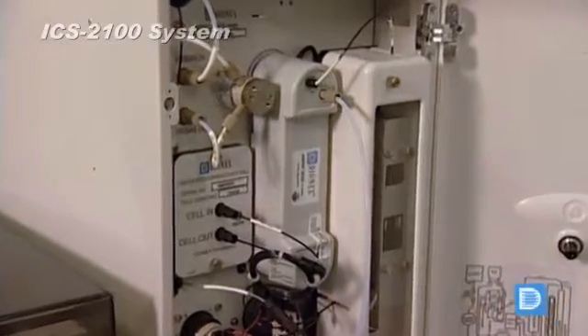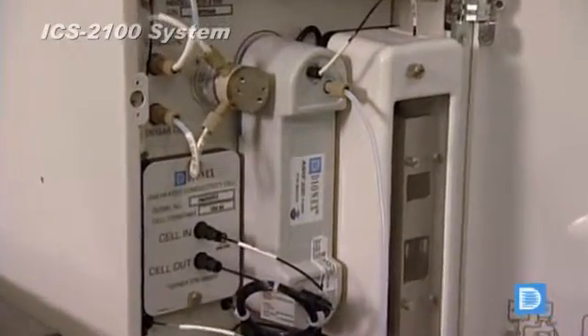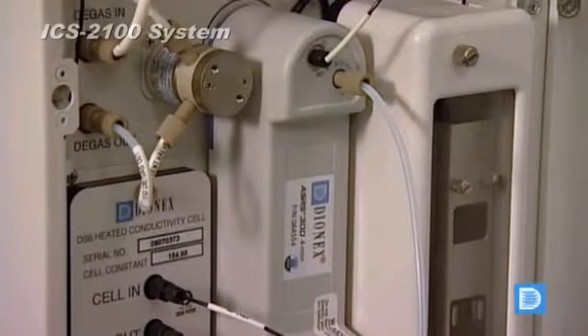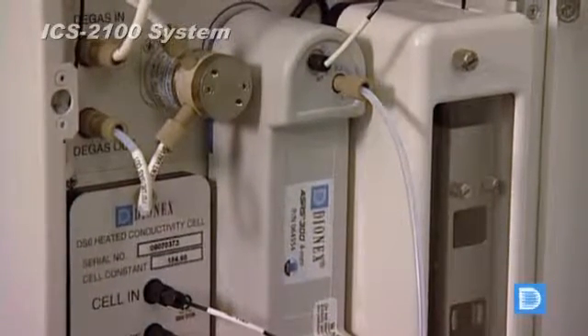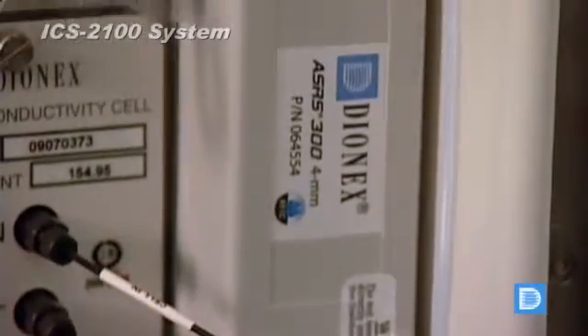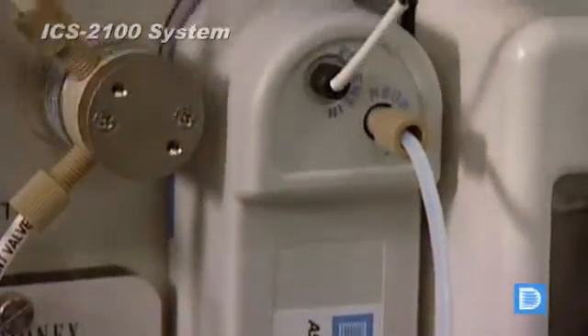Once installed, the SRS300 generates the ions necessary for eluent suppression — you just need to plug it in. There is no handling, makeup or disposal of acids and base regenerant solutions. One suppressor does the job.